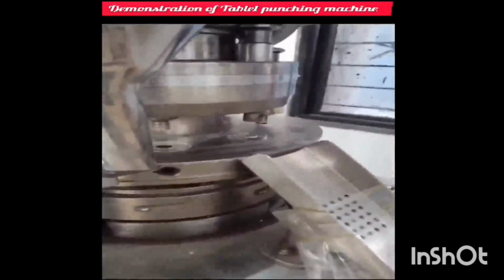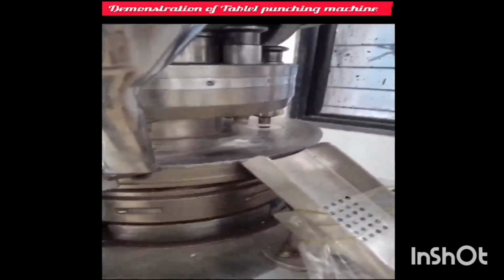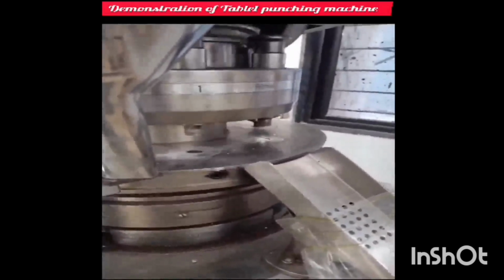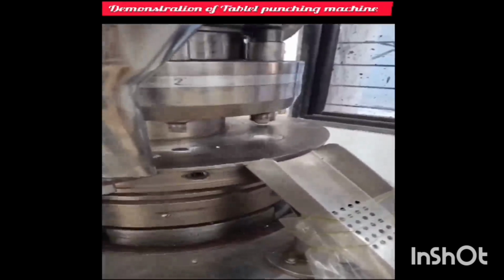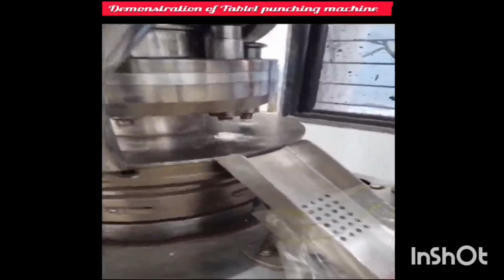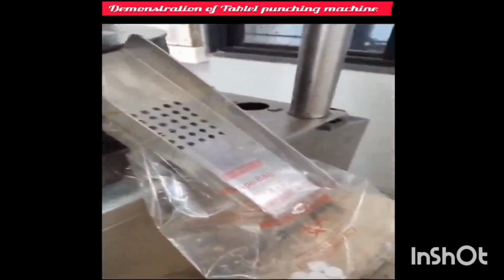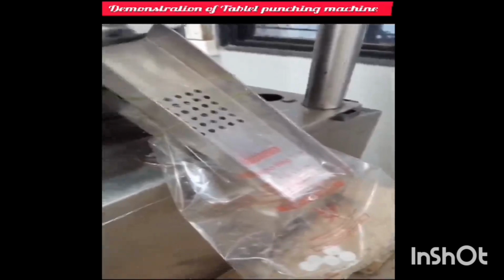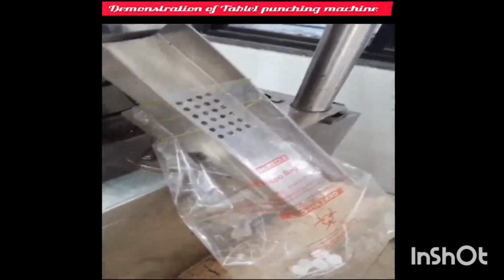Now as we have already fed, the granules will get compressed into the tablet. They will get punched and will immediately hop out. See, here is our tablet and after hopping out, it will get ejected and get collected into the collector bag. Now the tablet has already been punched and will get ejected and collected into the bag.